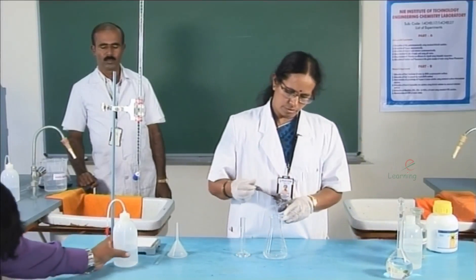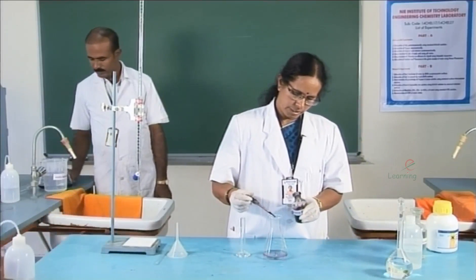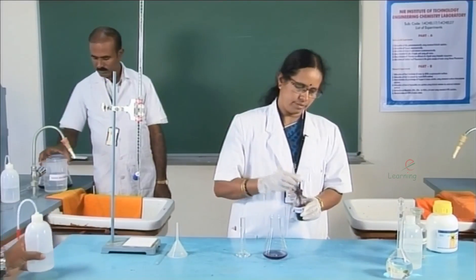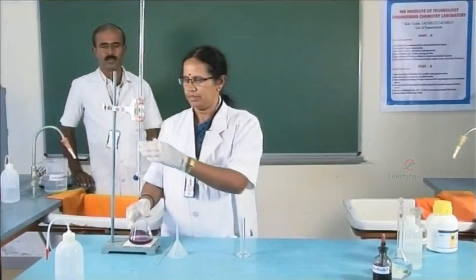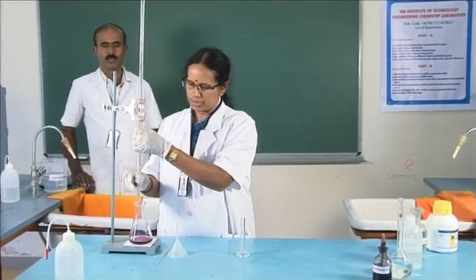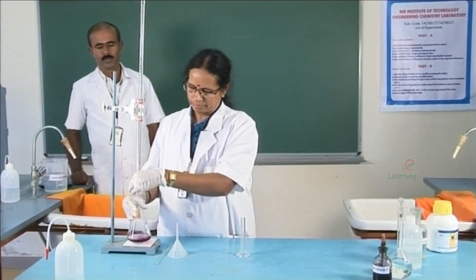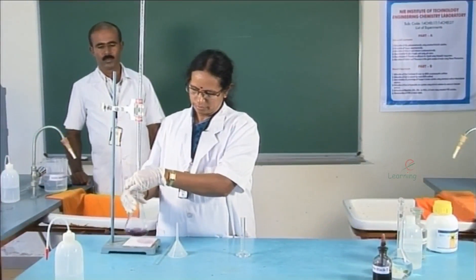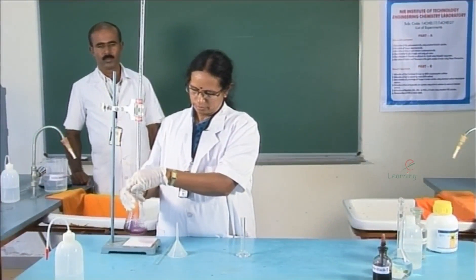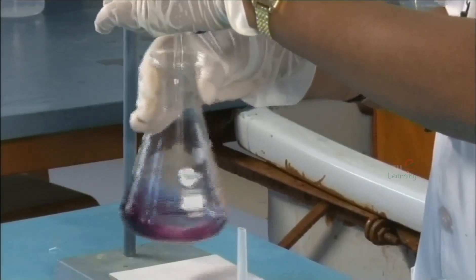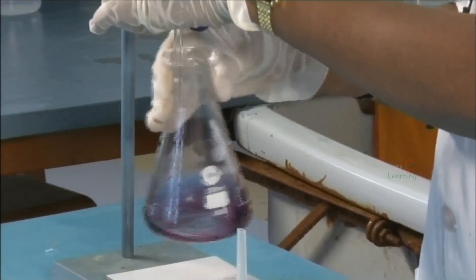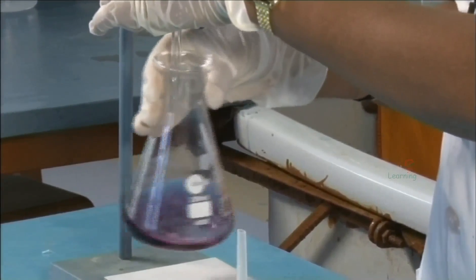2 to 3 drops of indicator are added and the third trial is continued with the same procedure. The titration is repeated to get the concordant values. A minimum of three trials have to be conducted.